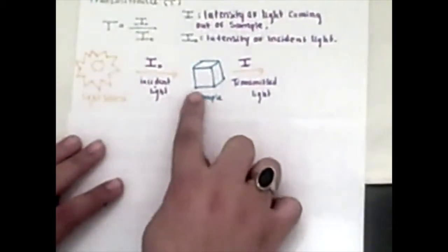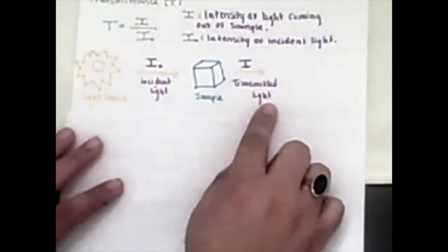This is a sample, and then the transmitted light is the intensity. Transmittance is the intensity of the light coming out over the intensity of the incident light. If no light is transmitted, meaning we see black coming out, then T is equal to 0.